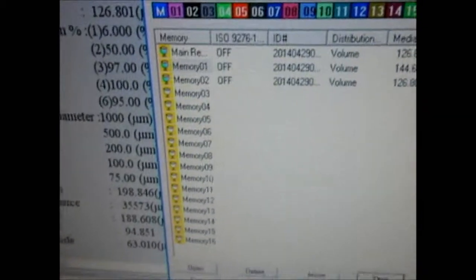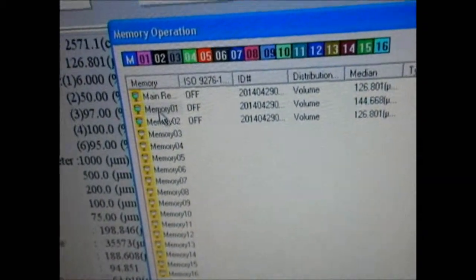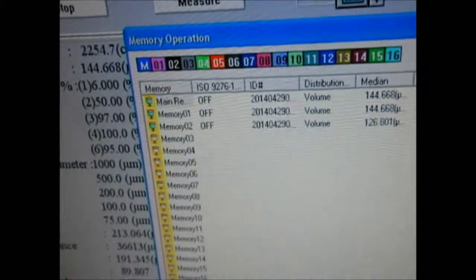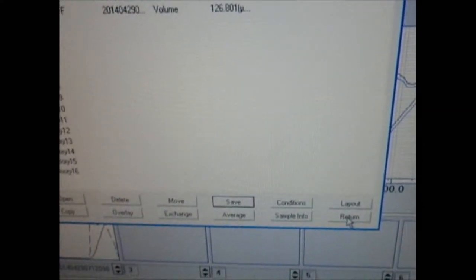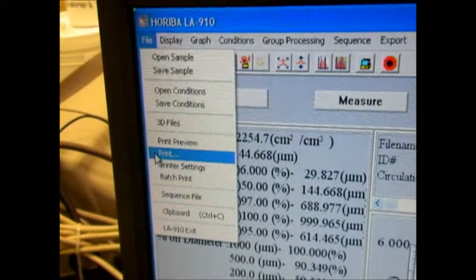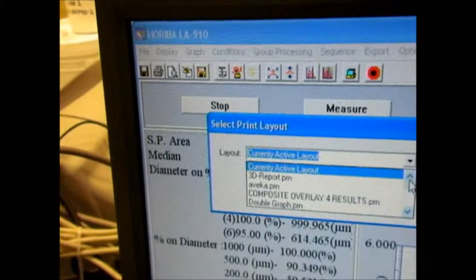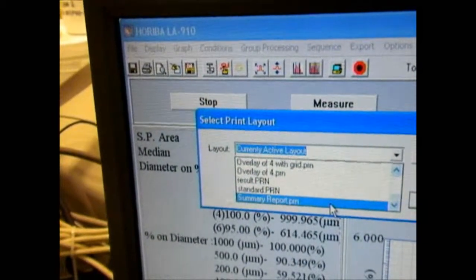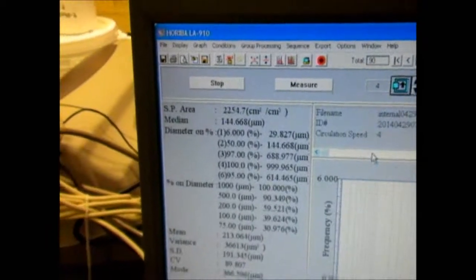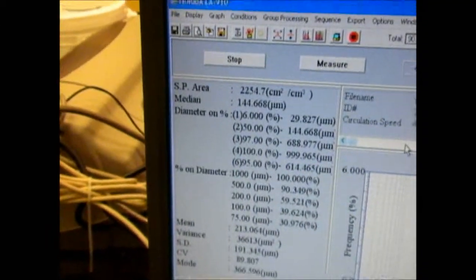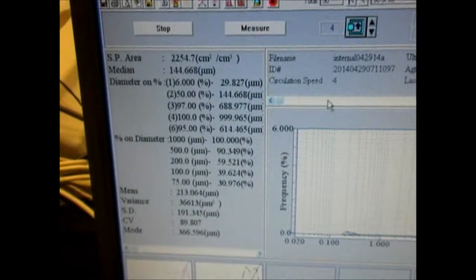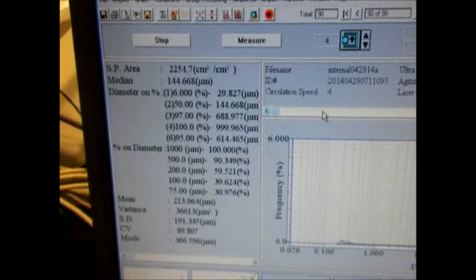To print the data, move the file of interest from the memory one slot to the main result — data gets printed from the main result slot. Hit the Return button to exit the field, then go under File and select Print. Generally you want the single summary report. Hit Print and it should print out. If you have a network connection, you might also be able to save this to the network or print to a PDF file that you can subsequently put onto a disk. This describes the operation of the Hariba LA-910.